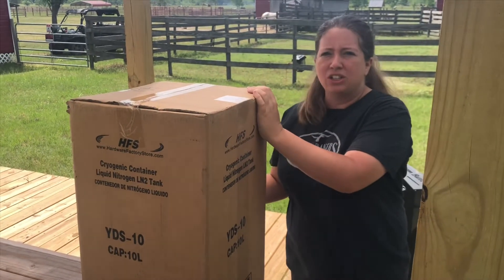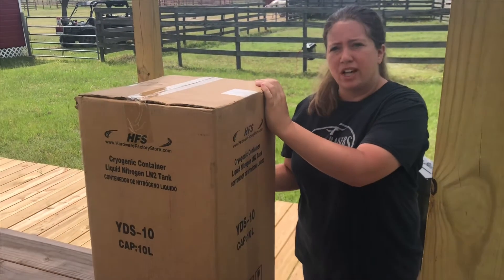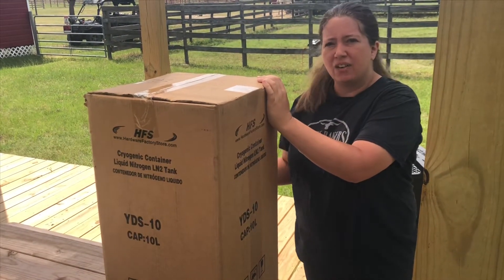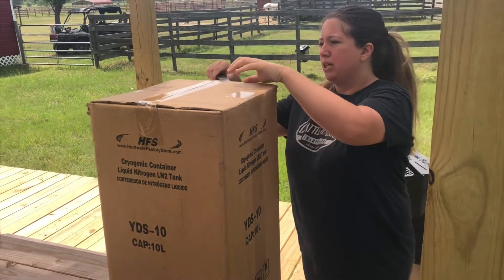So we really wanted to get liquid nitrogen. Also, I'm going to be learning this next coming year how to do AI, so this is something really great to have. It'll keep it cold for at least 60 days so I can wait for them to come into heat and then go ahead and do that. So let's go ahead and open it up right now.